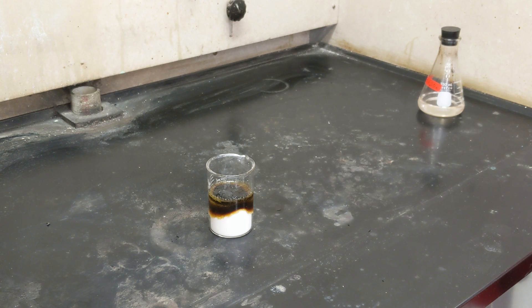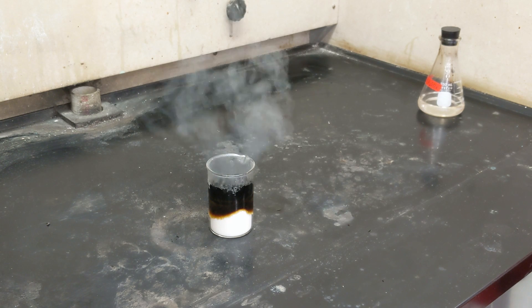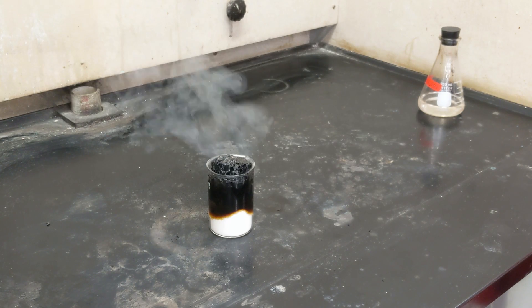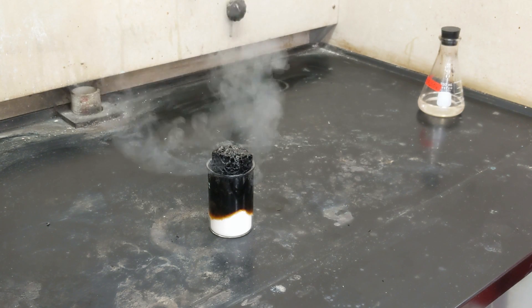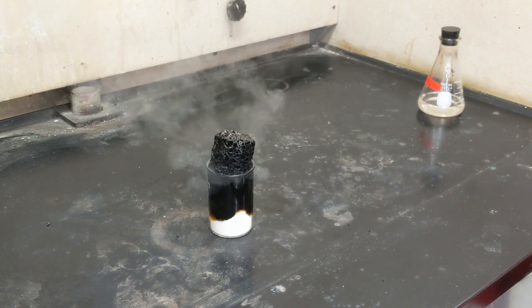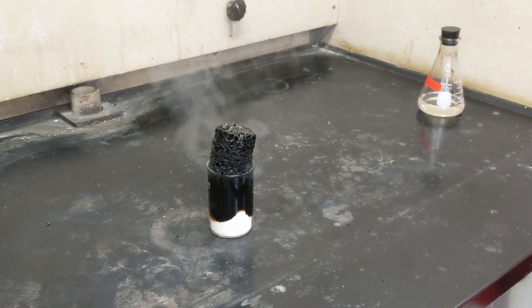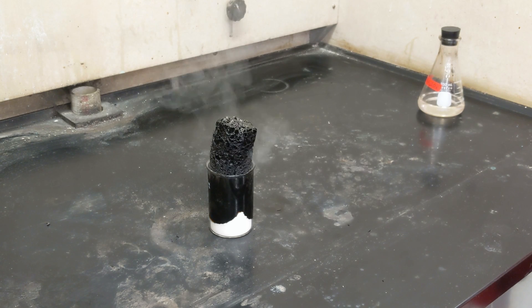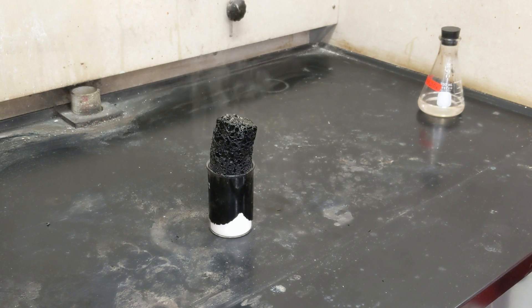It's starting to bubble. Turning black. Wow. Steam. It is hot. It's a little like the fireworks that you see in the summertime. This is called the carbon snake.